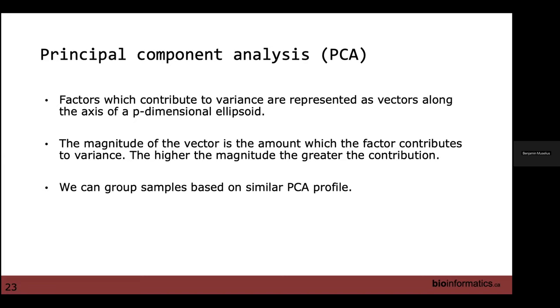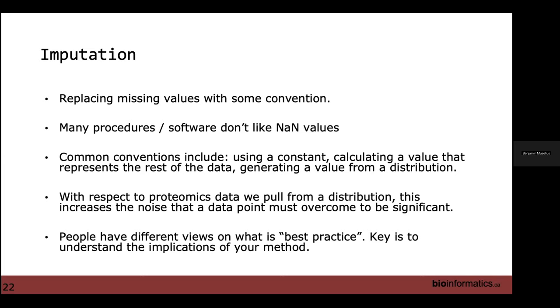Principal component analysis. Yeah. I guess like the tail end of it. Is that based off your entire data set? I believe it's at the protein level. So if you've identified a protein group in your uninfected, but your infected is NaNs, it'll take the values from the infected group and downshift those and then take from there. Yeah, that's the idea with the downshift, that you want to create noise for your statistical testing, but you don't want to accidentally impute values that are too large and show up as significant. So that's why you do the downshift.